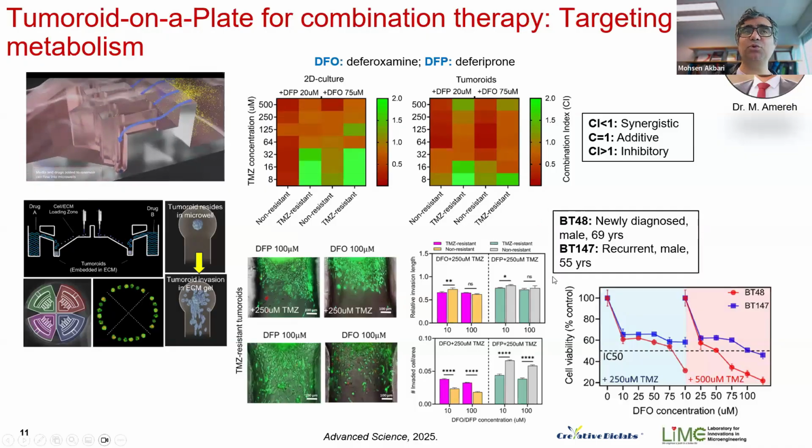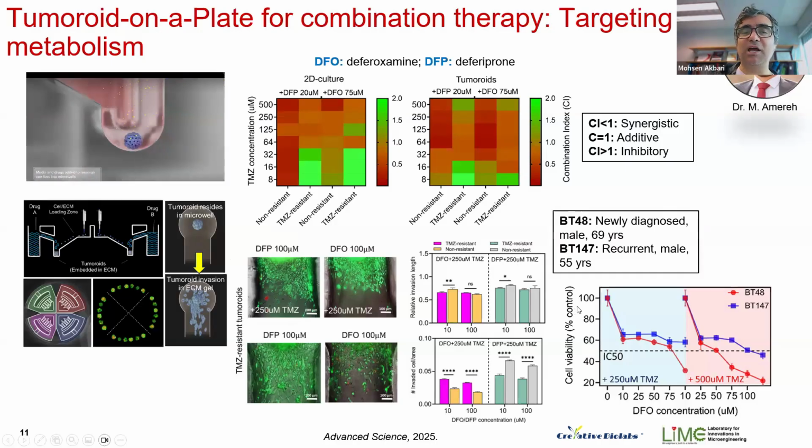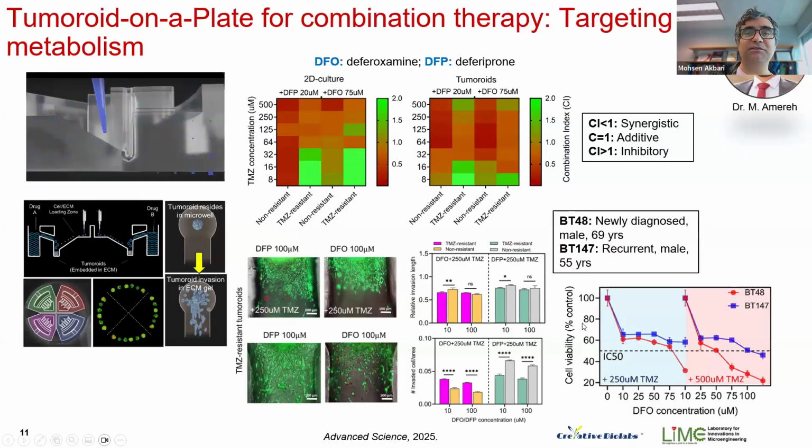So this clearly shows that this platform can be used for investigating combination therapy using cell lines and also different patient-derived cells.